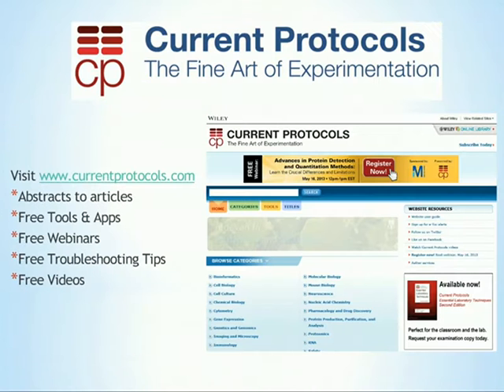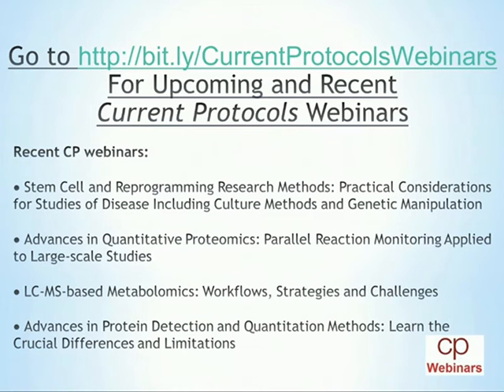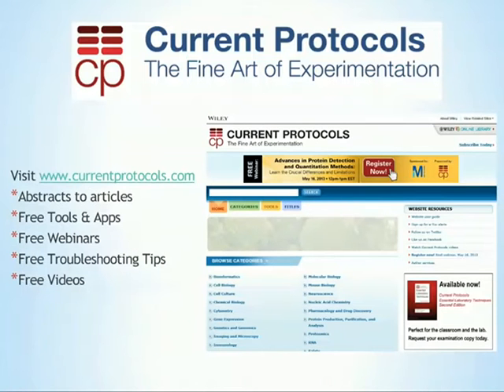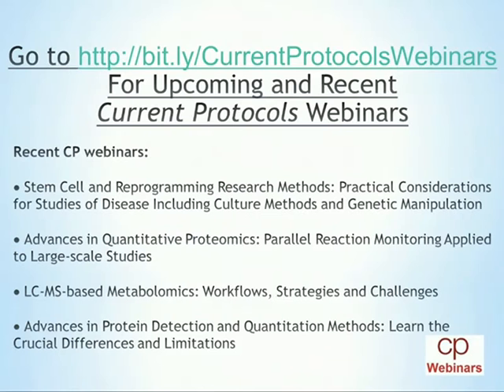All right. This next one I think would be for Dr. MacIvor. The question is, Dr. Haab mentioned the considerations necessary for collecting and analyzing data for each sample. How do the multiplex kits address these considerations? Okay. Thank you for the question. So our goal with our kits basically is to provide our customers with kits that perform consistently from lot to lot. So we do that in several ways.